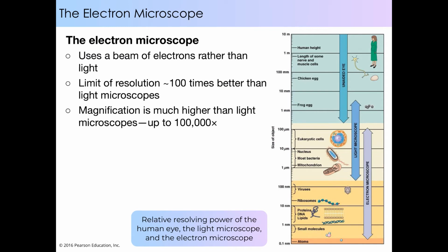Although fluorescence staining allows us to visualize the location of specific proteins and to label organelles, there is detail that cannot be visualized with fluorescent microscopes. Now, there are super resolution fluorescent microscopes that allow us to visualize structures ranging from 50 to 100 nanometers. However, some structures like ribosomes, as you can see here, are smaller than this. So electron microscopes are needed for these types of structures.